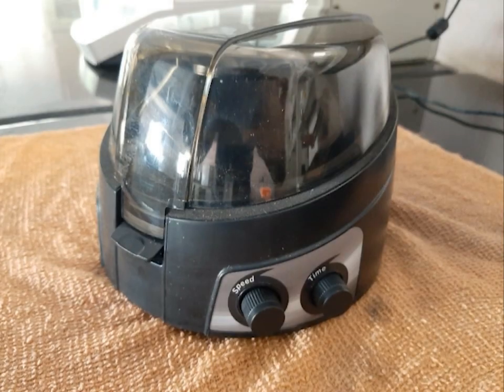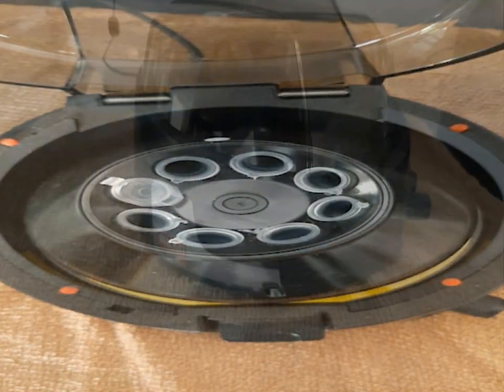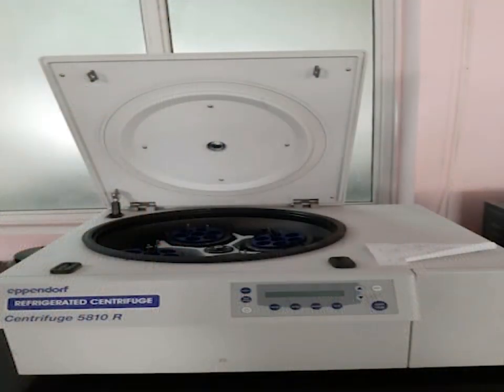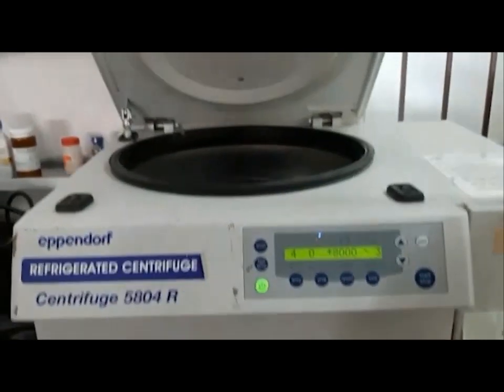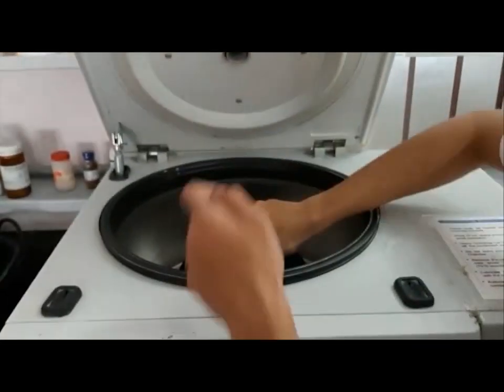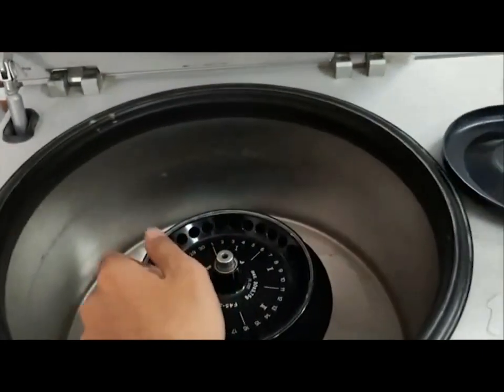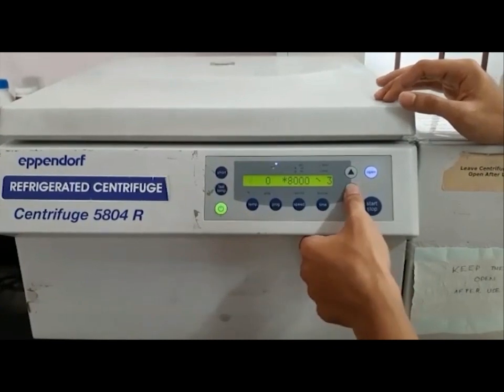A centrifuge is a device for separating particles from a solution according to their size, shape, density, viscosity of the medium, and rotor speed. In a solution, particles whose density is higher than that of the solvent sink — that is, they sediment — and particles that are lighter float to the top. The greater the difference in density, the faster they move.